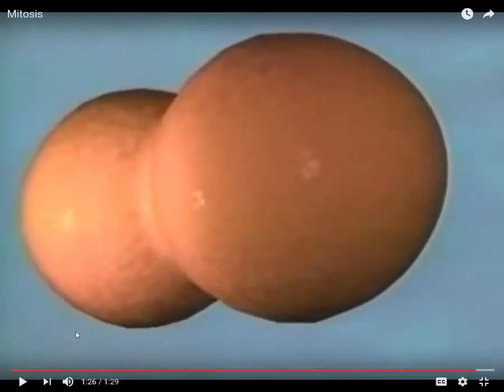Now see how that cytoplasm is pinching inward? This animation, it happens a little later in the animation, actually happens toward the end of anaphase is when that pinching in occurs. So the last phase of mitosis where the pinching in occurs but the nuclear membranes haven't appeared yet would be called telophase. So look for that figure 8 appearance for telophase in the microscope.